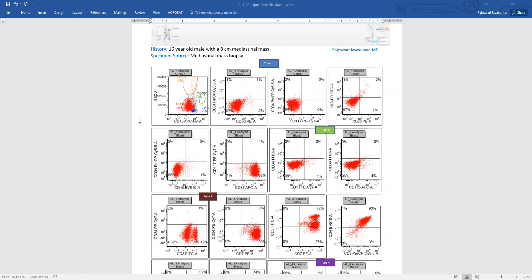So let's start with CD45 versus side scatter. We see the bulk of the cells are here painted red in the blast gate, which is defined by a dim CD45 and low side scatter.